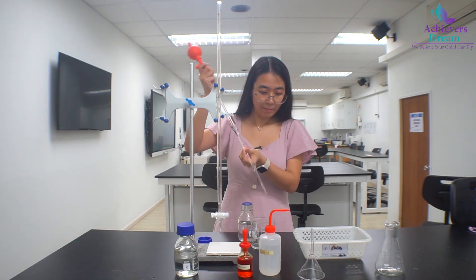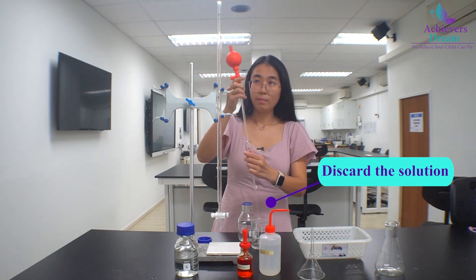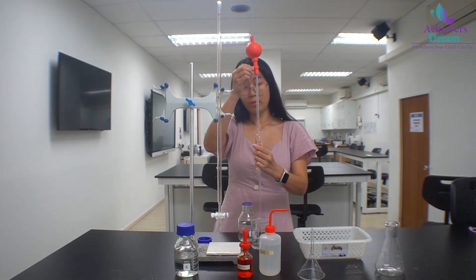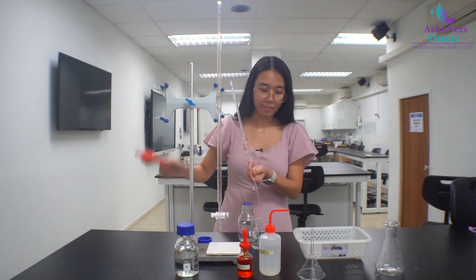Once you are done, we will discard the solution by pressing E to remove the solution, or another simple way is just to remove the pipette filler.